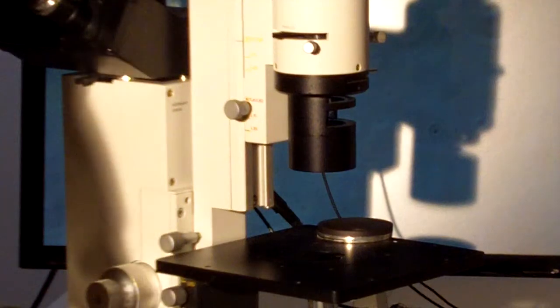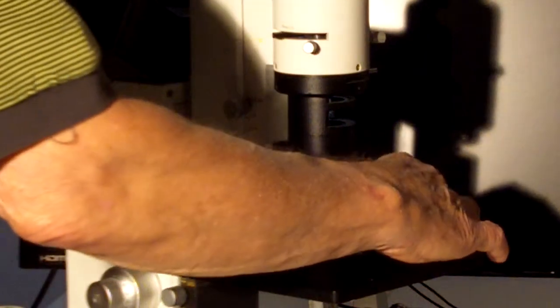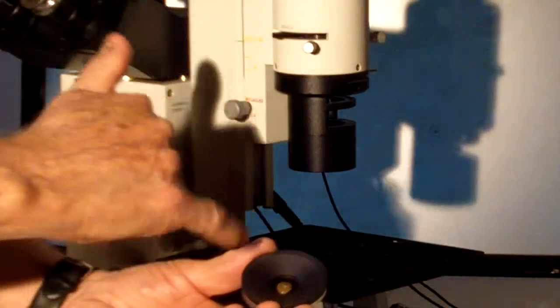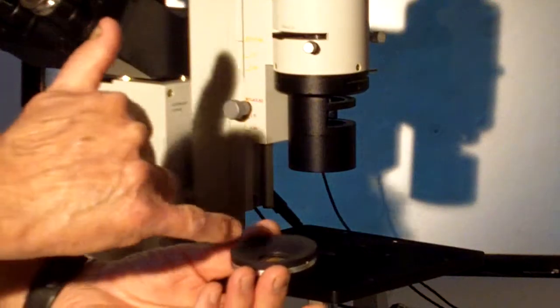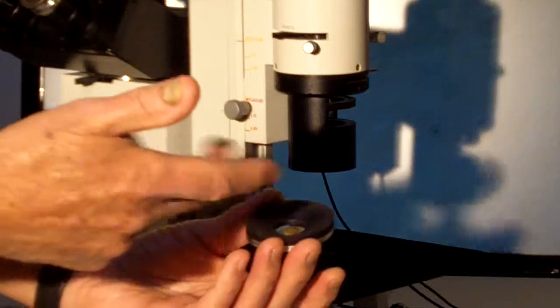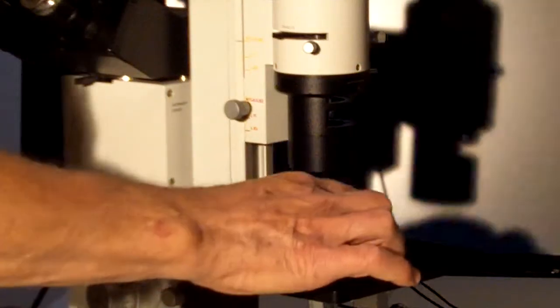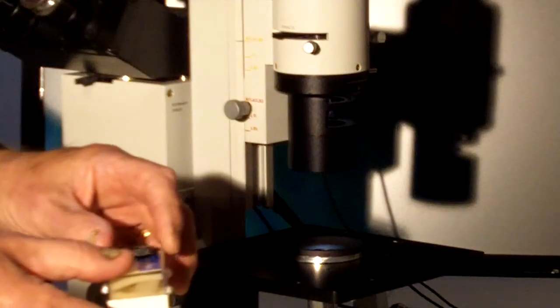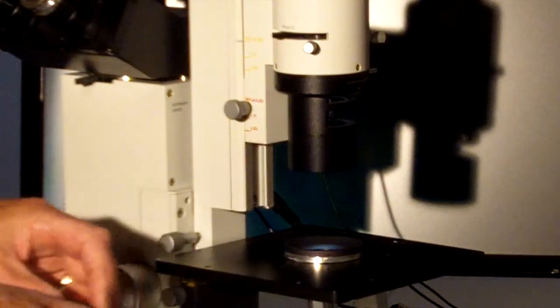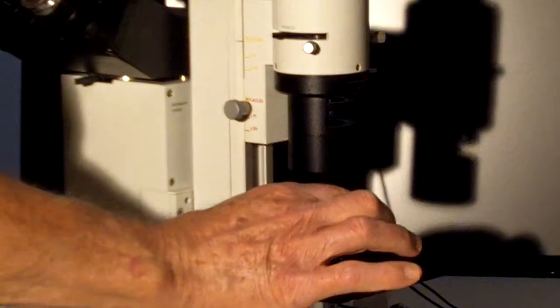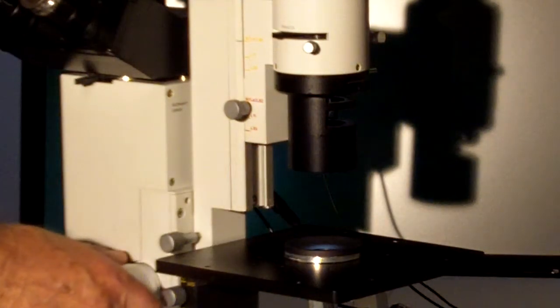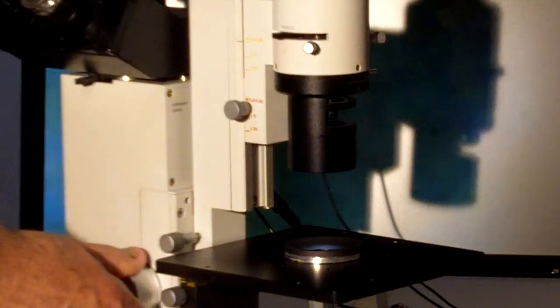Here the Diavert starts showing some capabilities that really make it interesting, especially for things like pond water. If we have a slide with a chamber, this is a little chamber we make here at Brunton. It's a 50 millimeter dish but the bottom is an interchangeable cover glass, so we can swap out one inch cover slips in the bottom of this chamber.